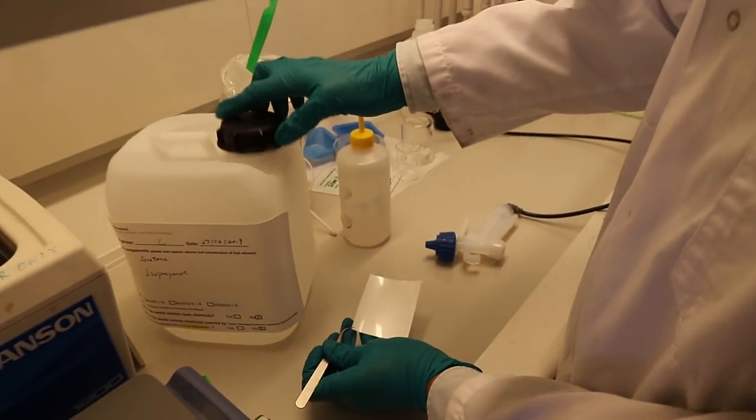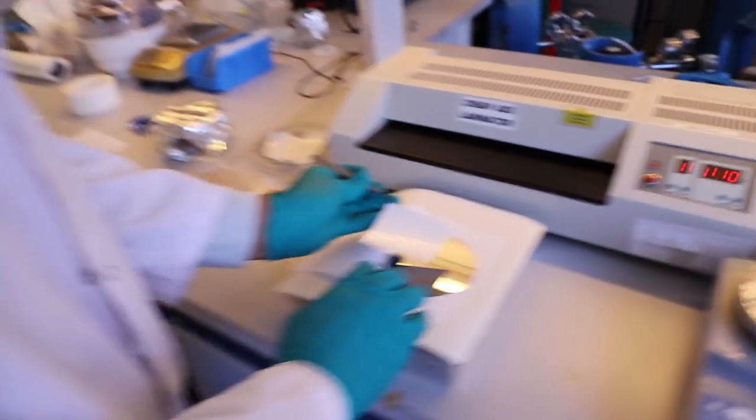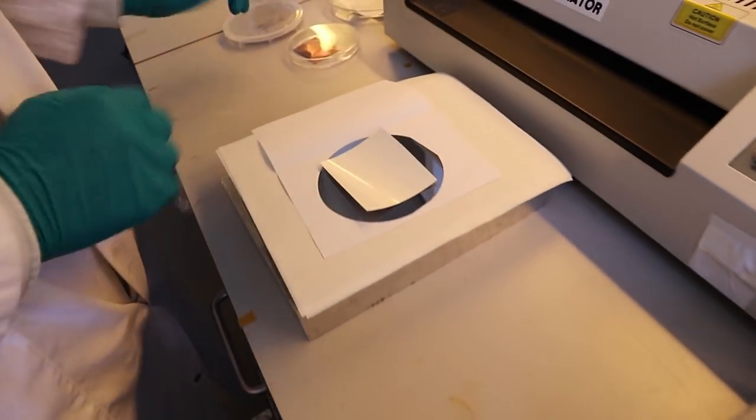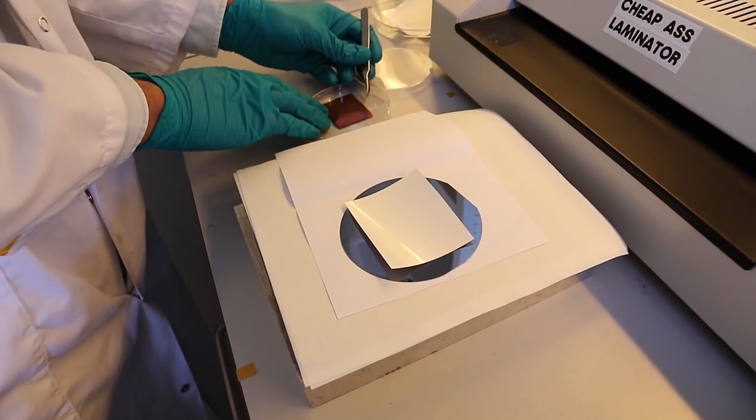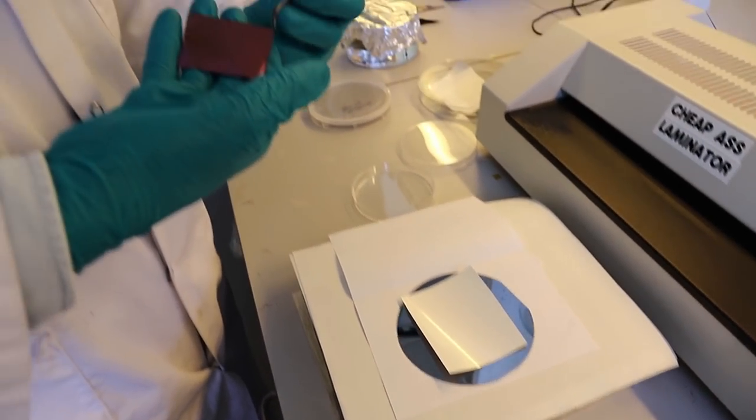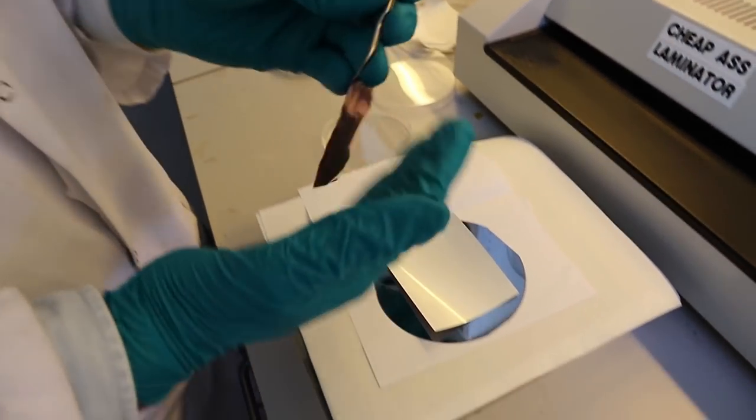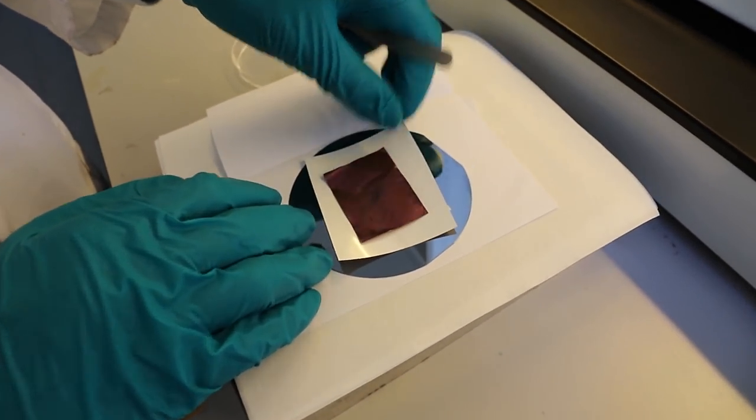Okay, it's completely dry now. We're now going to laminate the copper foil on top of this PVA foil. We place the copper foil facing down onto the PVA foil like this.